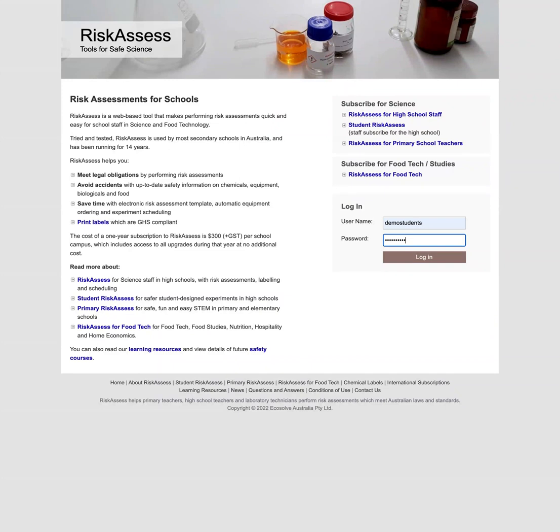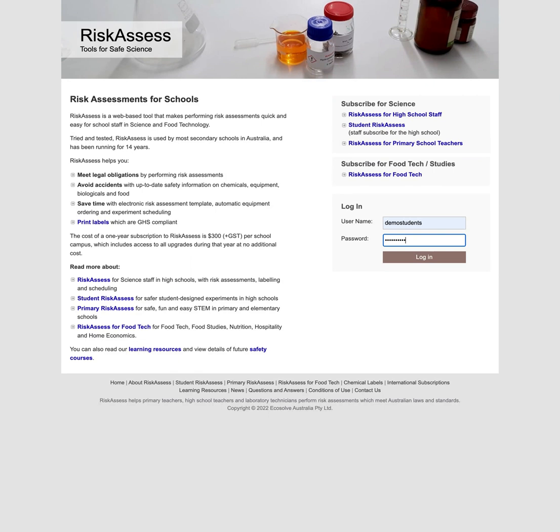Risk Assess helps you carry out a risk assessment of any experiment. It provides you with background information on the hazards of chemicals, equipment, and biologicals. I'll show you how you can start your risk assessment, protect it with a PIN, and come back to finish it later.